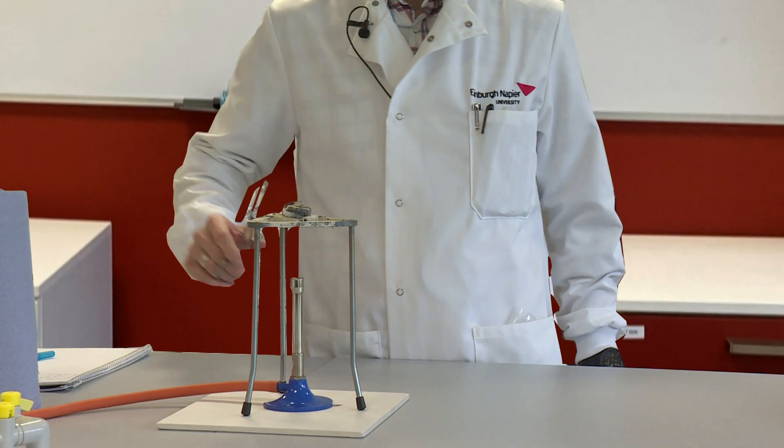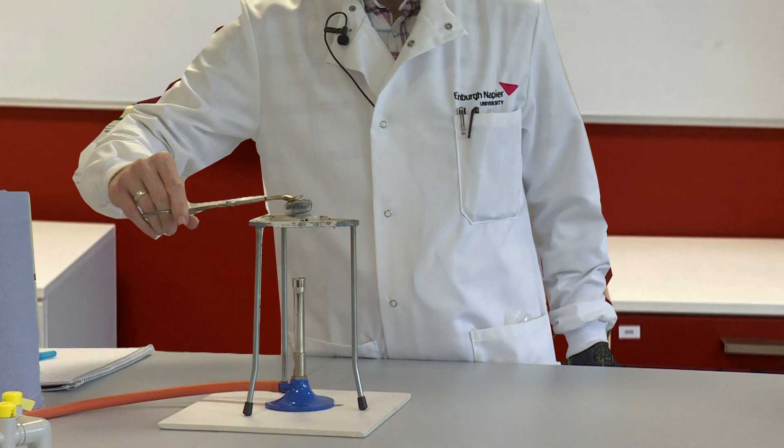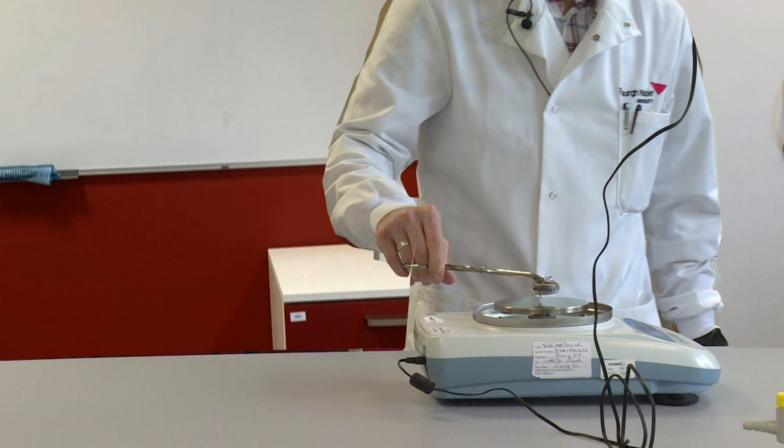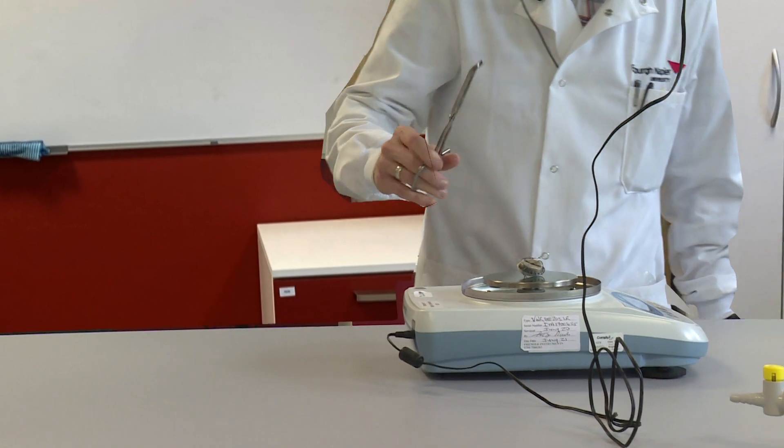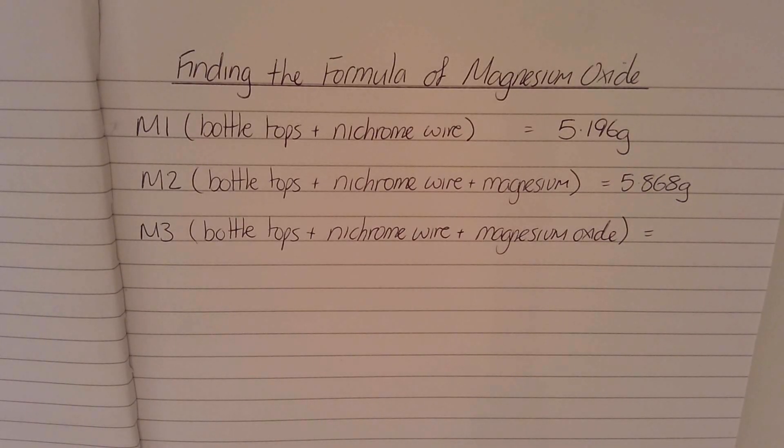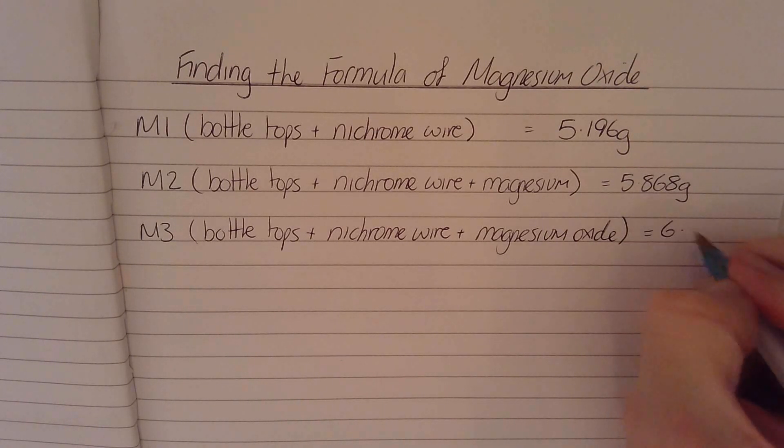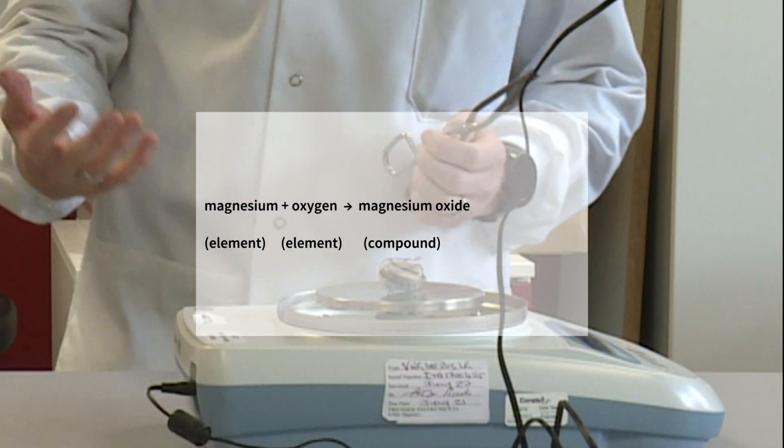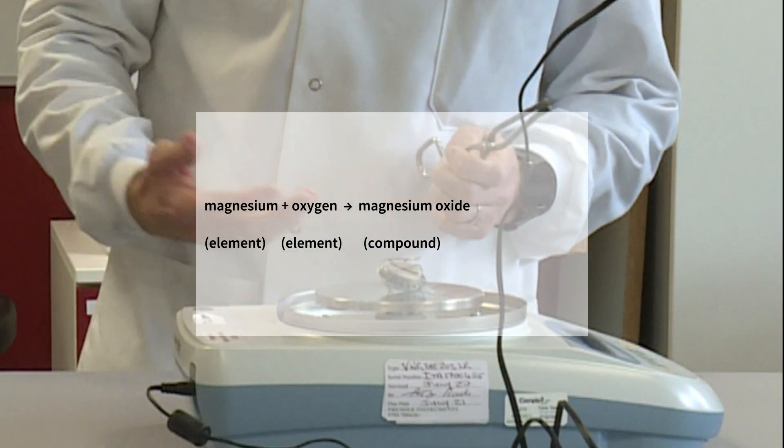If we now transfer the bottle tops and re-weigh them, the mass is now 6.332 grams. So as you can see, we've had an increase in mass. We started with 5.868 grams of magnesium, and once it's reacted with the oxygen in the air, it's now 6.332 grams.